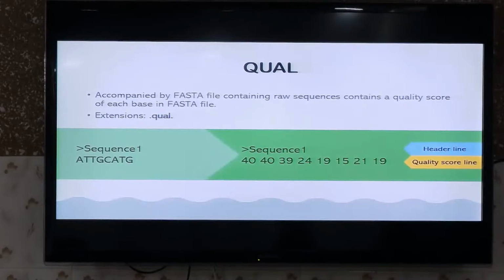And this must not vary. Otherwise, if you want to compile your FASTA file into a FASTQ file, you will get an error. A FASTQ file is a combination of FASTA and quality scores. That was the file we were getting in the first generation of next-generation sequencers, but the sequencers we are using right now give us files in FASTQ format only.